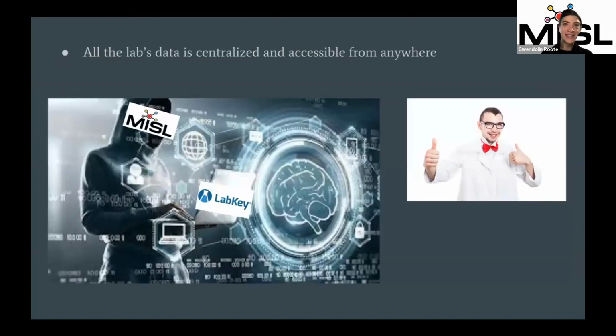All of our lab's data is centralized and accessible from anywhere. So instead of people storing files on their own computers, storing on computers in the lab, even leaving data on instruments because it's simpler, now everything is in one place and we can get to that information from anywhere just by logging in. Having it all in the cloud and online is really crucial. And I access Sample Manager from my phone, from the lab, while I'm on vacation. It's great.